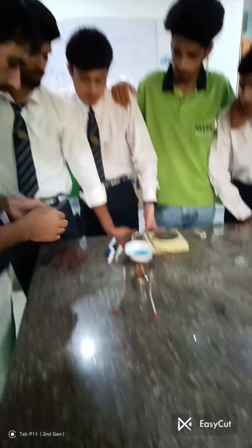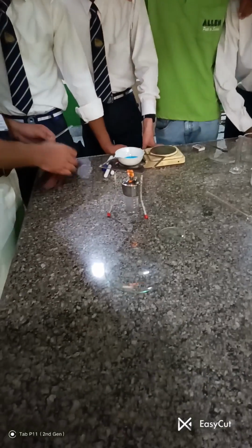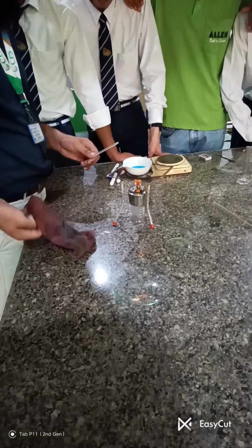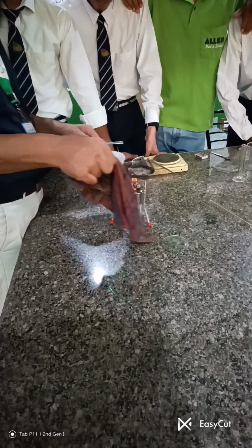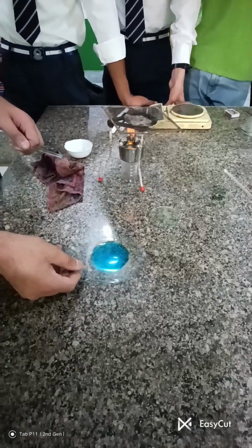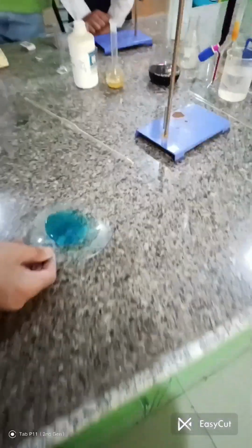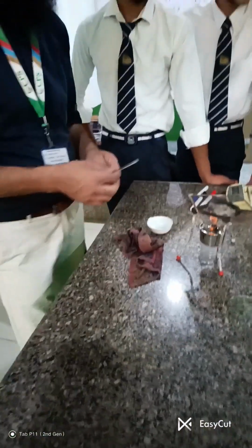Now after that, what will we do? We will simply transfer the solution onto this watch glass and keep it undisturbed. If we disturb it, no crystallization will take place. But if we keep it for cooling for at least half an hour, you will see the beautiful crystals appear in the watch glass.